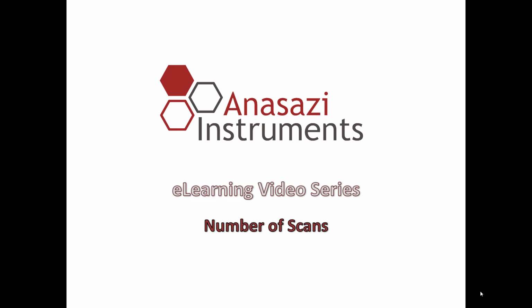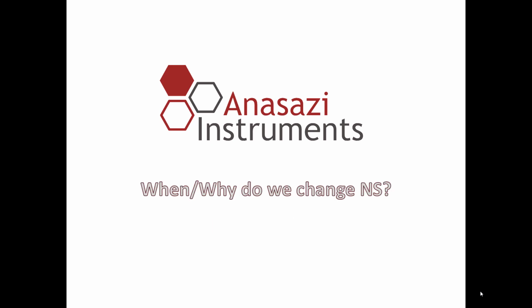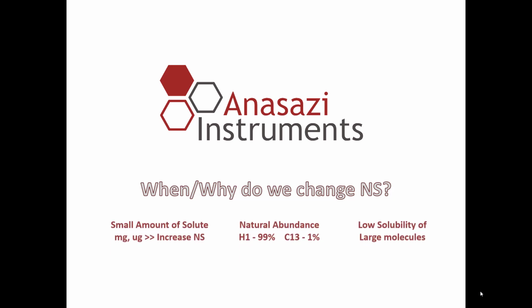Today I'm going to talk about how number of scans affects NMR data. So first question is, of course, when or why do we change the number of scans? Well, there's a lot of different reasons, but we'll take a look at these right now.